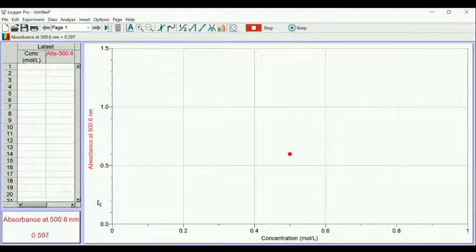And I should also say the absorbance values are unitless. So if you're wondering what's the unit of absorbance, there is none. It's just 0.600, 0.597, maybe you want to say here. Okay. And now let's take this absorbance reading for solution B. I'll pop that one in there. So the absorbance for solution B is 0.570. Again, that's a unitless value. And then now we have all the information that we need to complete this.